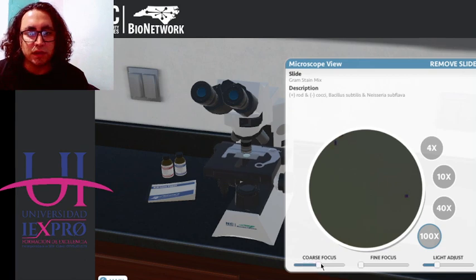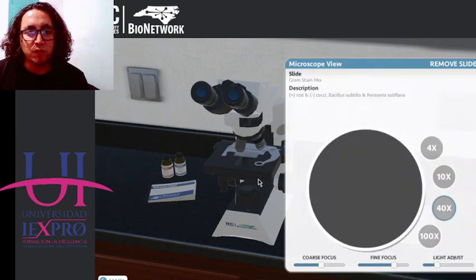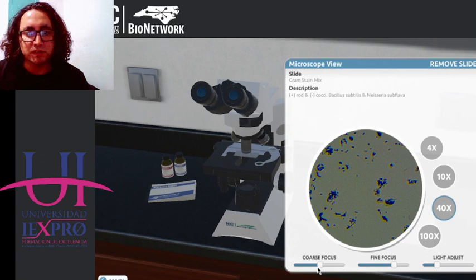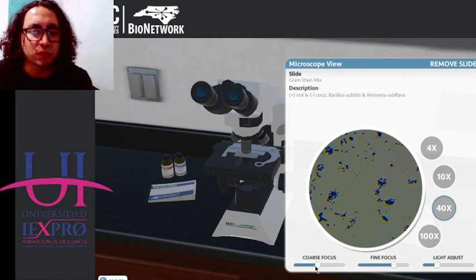Okay, I have a mistake here. Fine focus. Okay, I'm not able to see very well, so maybe I can continue in 40, but I need to clean before. Okay, so maybe 40 is the best option. Yes, just like that. 40, fine focus, and well, in this case, I think it is the only way I can see something. Okay, in this kind of microscope, this is the best resolution that I have for Gram stain mix. So maybe this is enough.